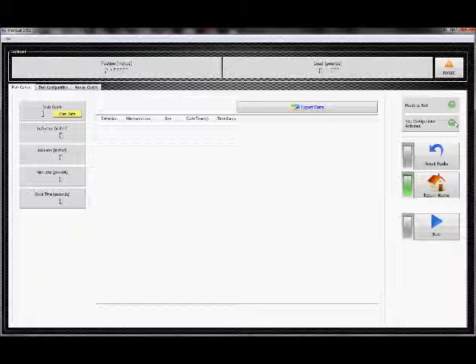So I've activated my test. I'm home and I'm ready to test. I've put a generic golf ball into the system, and we are going to run it. I click run. We see that my cycle is running. I'm moving. There's my force. And there are the results. There's my deflection. There's a measurement of the ball I have. Maximum load that was recorded. The cycle time. And I also give a timestamp that is useful when you're looking back over the data.